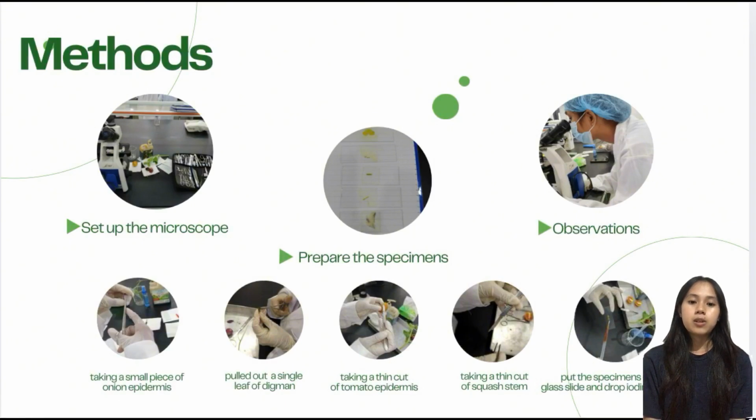The onion epidermis was peeled from a fresh onion layer, and the digman or hydrilla was taken from a single leaf. The tomato epidermis was carefully sliced from the outer skin, and a thin cross-section of squash stem was taken using a blade. Each specimen was placed on a glass slide, stained with iodine to improve clarity, and covered with a cover slip. Then we observed all samples under the low power objective, or LPO, and the high power objective, or HPO, to examine their cell structures and details.